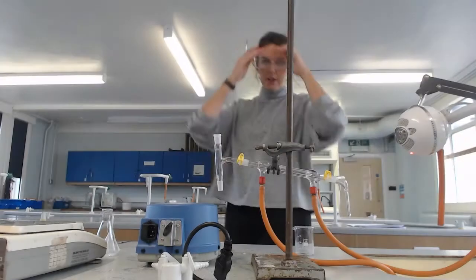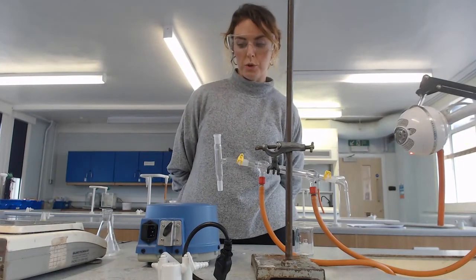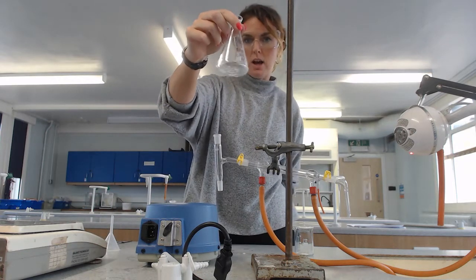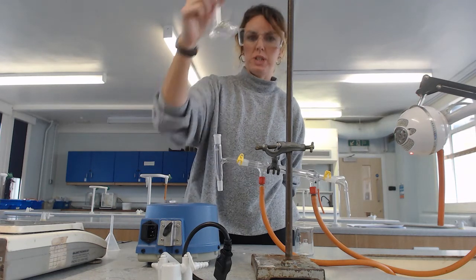This is the third and final part of this required practical: distillation of your product. In part two, we left off with adding some anhydrous calcium chloride to the product to get rid of the water that was still in there.